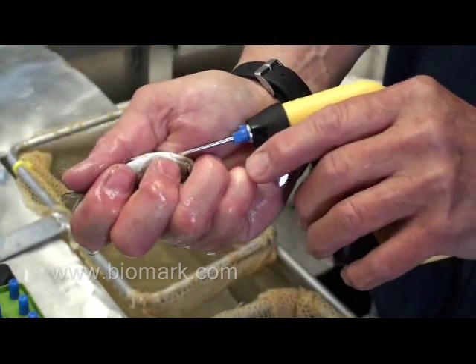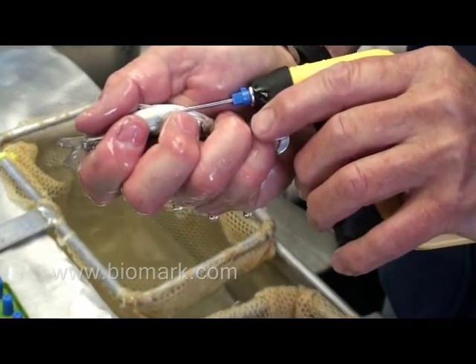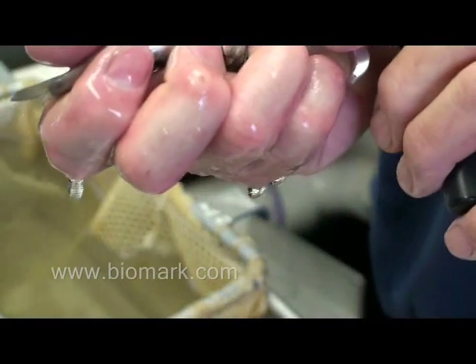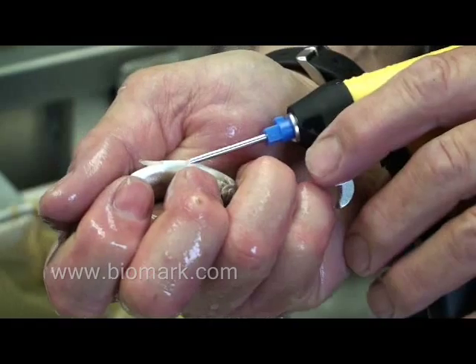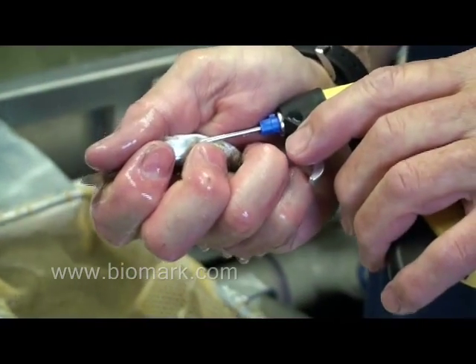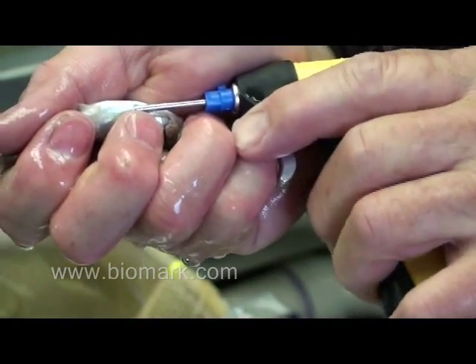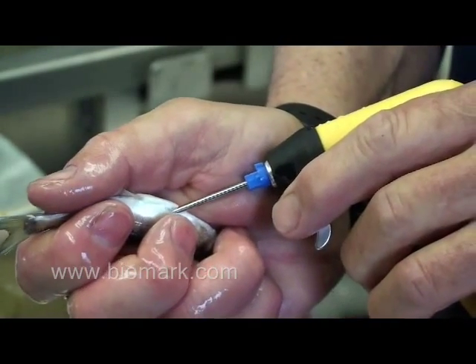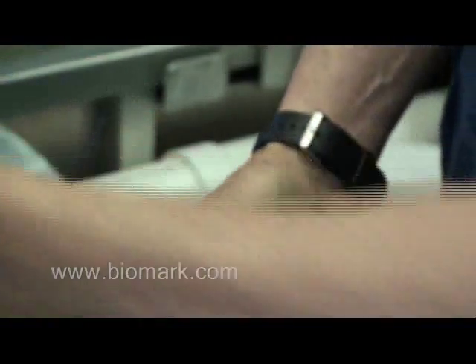The needle is injected just behind the pectoral fin, at about the color change at the bottom of the base of the rib cage. The tag is injected inside the peritoneal cavity. We try to get the needle as parallel to the body axis as possible so the tag will lay in the area between the tag entry wound and the pelvic fins. We like to get the tag as close to the body wall as possible so the tag rides against the body wall rather than going down into the vital organs. A steep angle would push the tag directly into the kidneys and possibly through the spleen, but leveling it out means the tag rides right above the stomach and intestines.